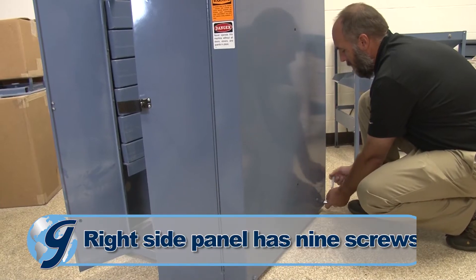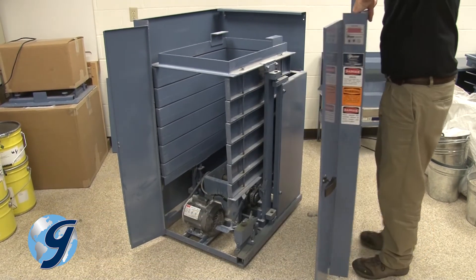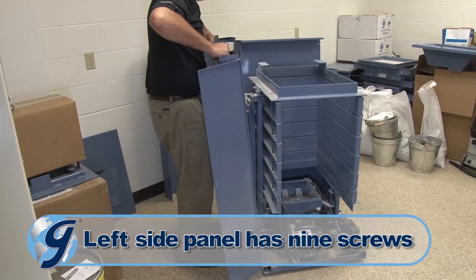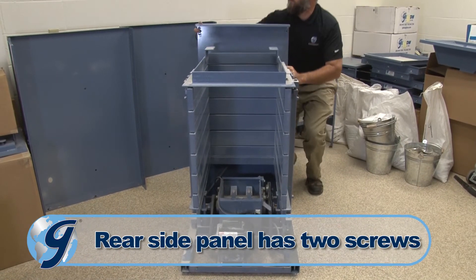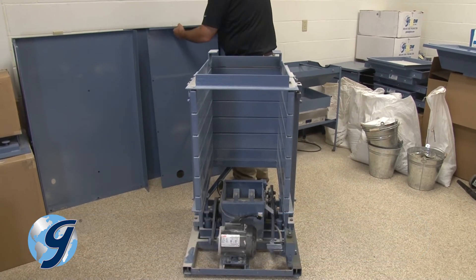Remove the mounting screws from the right side panel. Pull the right side panel off the unit and set it aside. Next, remove the mounting screws from the left side panel. Pull the left side panel off the unit and set it aside. Finally, remove the rear panel mounting screws and pull the rear panel off the unit and set it aside.